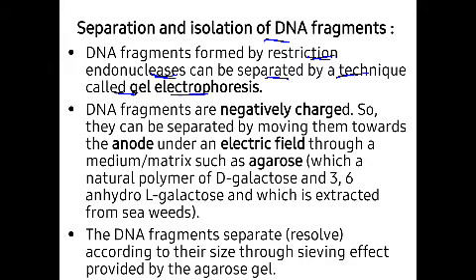Okay, the name itself suggests that a certain electricity will be given to a certain type of gel. So in such a gel this DNA has to be moved, this DNA has to be separated. Okay, we will study in detail.